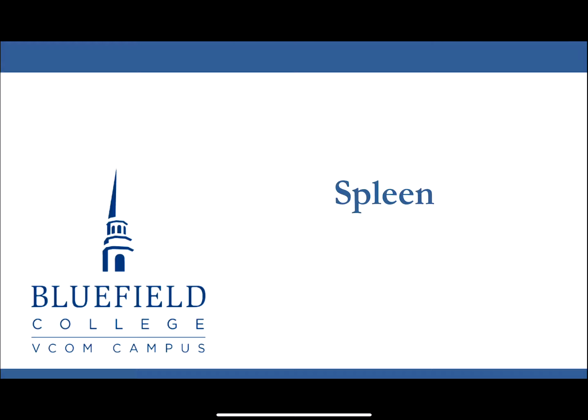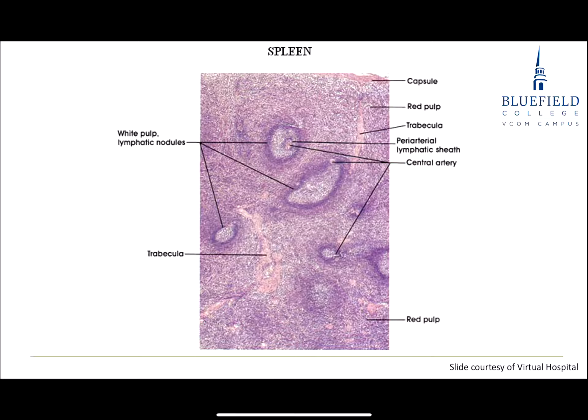Okay, we'll come up to spleen. I'll kind of illustrate differences as well. Okay, here we are, spleen. Spleen's next, and we'll get to thymus. All right, spleen, nothing jumps out at you and says spleen, but you do look at it, you see lymphatic nodules in there.